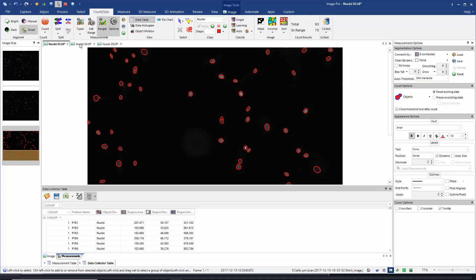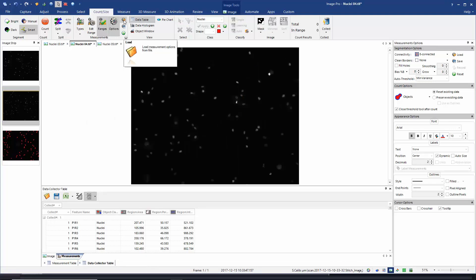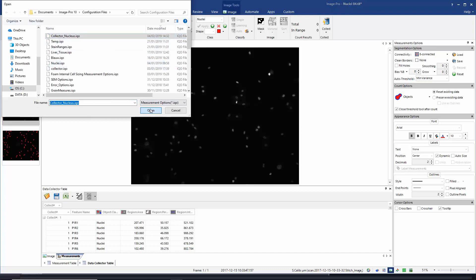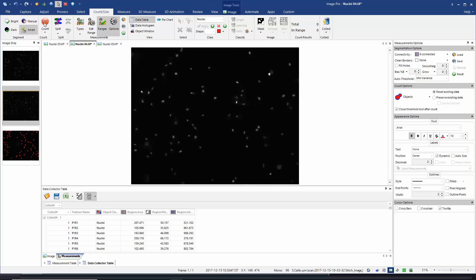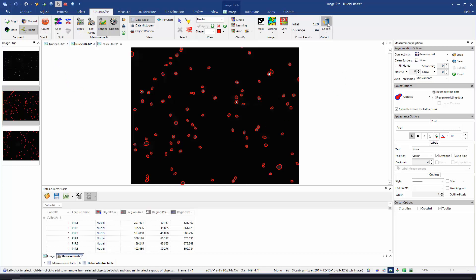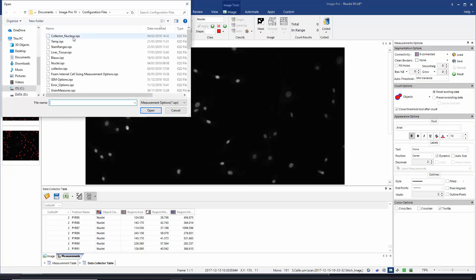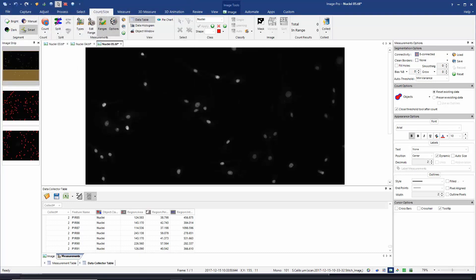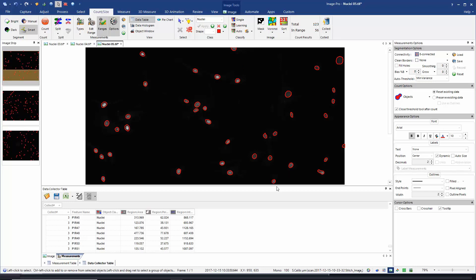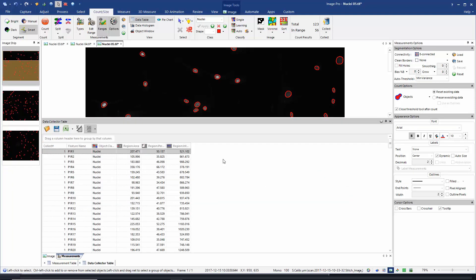Now I can go to my second image, restore my measurements options, count my objects, and collect. I'll do the same for my third image — restore my measurements options, make a count, and collect. Let's take a quick look at the data collector table. Scrolling through the table, you can see that I've made three collections.